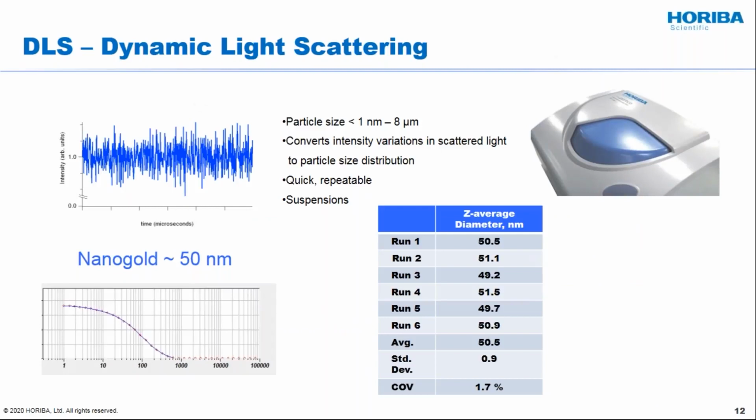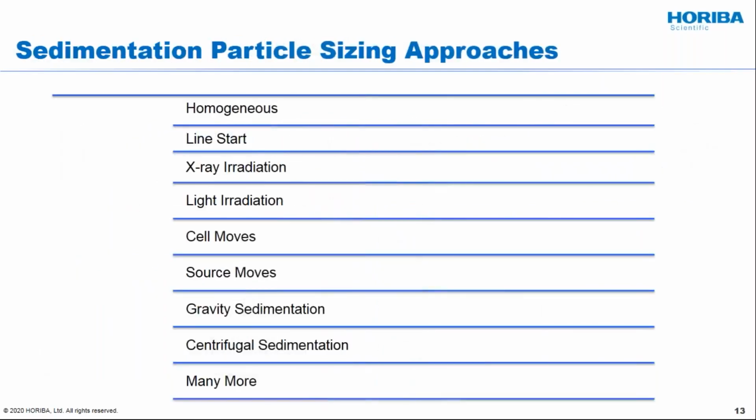So again, if you're looking for small materials, that might be a way to go. Now, as we mentioned earlier, a lot of other techniques we don't even really have time to talk about today. Today, we're just introducing you to the general subject, but just to illustrate some of the complexities of what you're going to deal with, look at this next slide, the sedimentation analyses.